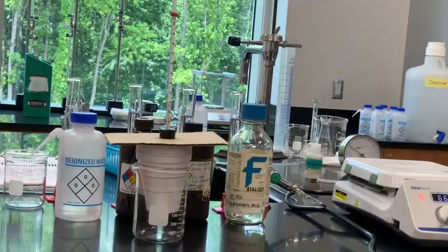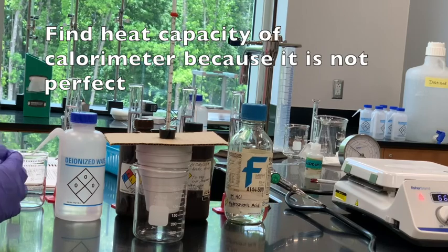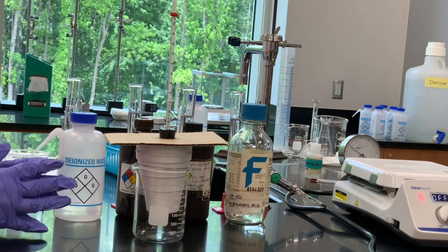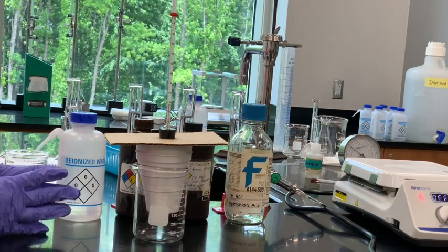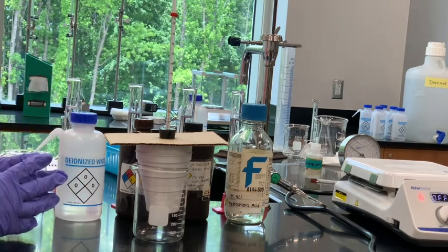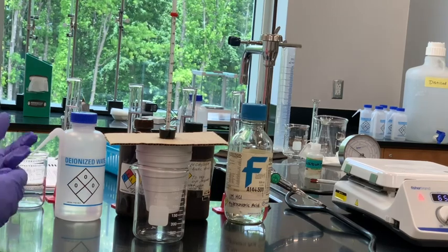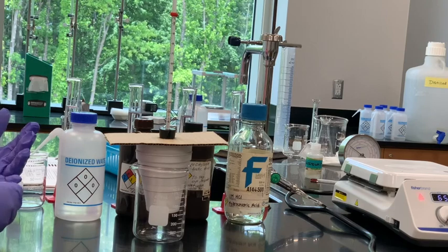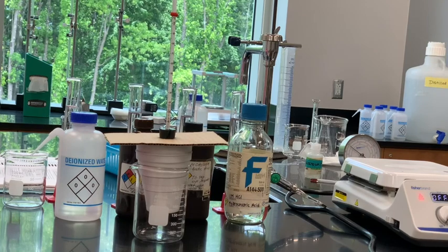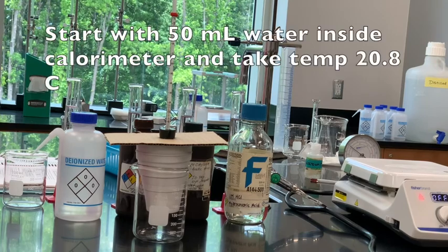This calorimeter isn't perfect, which is why we have to do Part A. Part A is finding the heat capacity of the calorimeter. This setup is going to absorb some of the energy being transmitted in our reactions or heat transfers, so we need to know how much heat is going to be absorbed by the calorimeter itself. For Part A, we're going to start with 50 milliliters of water inside our calorimeter.